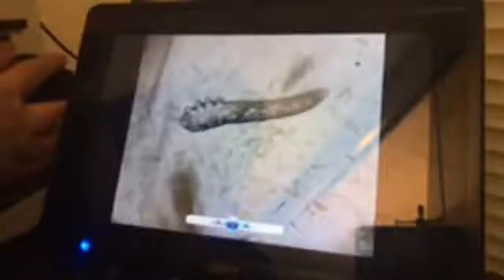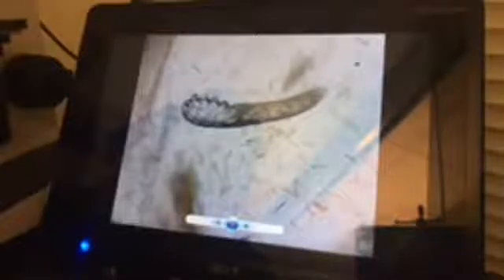So you can see those legs moving around. At night time, when they're entering and exiting hair follicles, those little legs are scraping over your skin. And for those of you that do have a higher population density, obviously there's more mites to feel those legs moving. So you can tell it's a female. Let me just focus on the body.